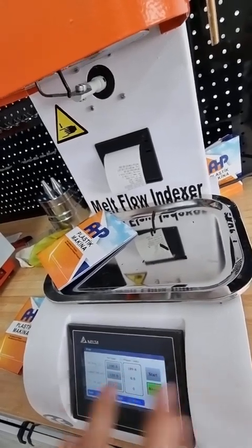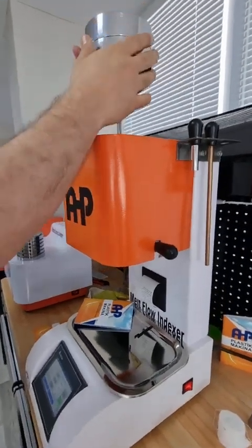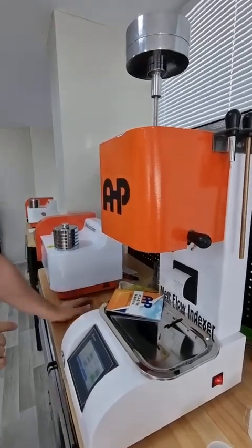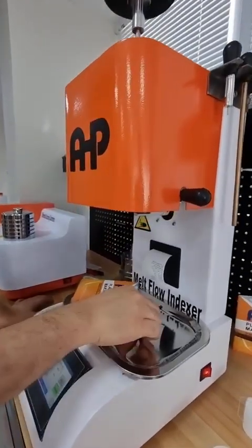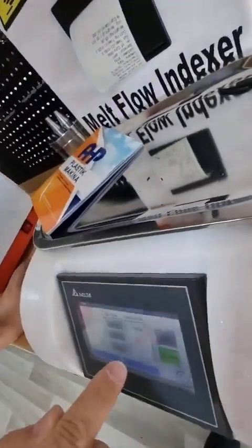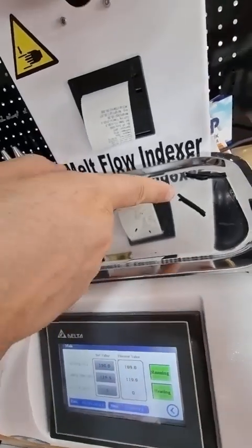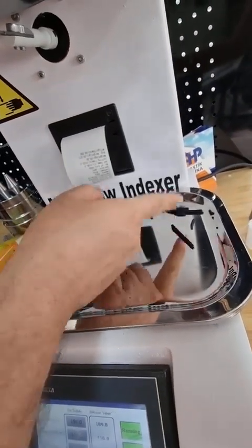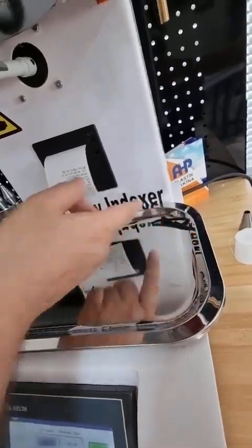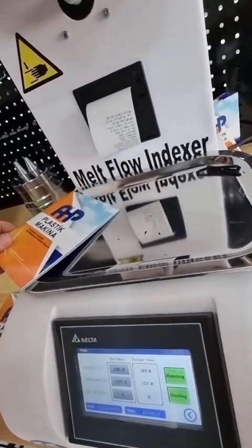The temperature is now stabilized at 189.8°C. I'm placing the 5 kg weight on the piston for polyethylene and starting the test. Click 'Start.' For the first cutout, put it aside. Note that the cutting time should not be set such that the sample piece length goes below 10 mm.